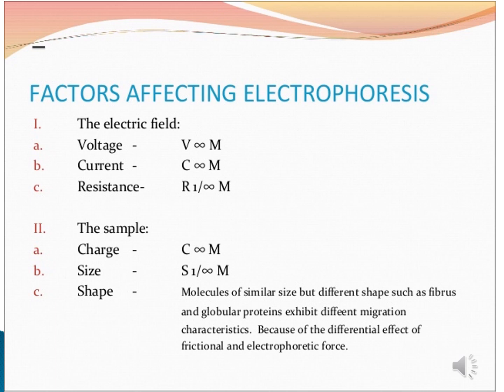The second is sample character. A molecule having high charge has better separation. Size is inversely proportional to the rate of separation. And regarding shape, molecules which are spherical and ovoid will move at a faster rate than aspherical and irregular shapes. Then the third part is buffer nature. A buffer having good ionic strength and very good pH maintenance characters will help for better separation.